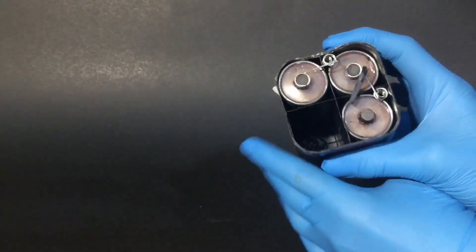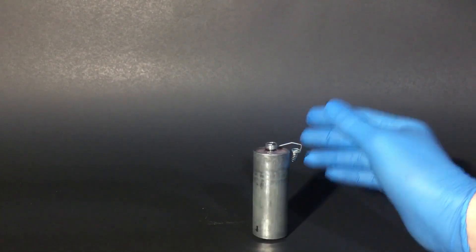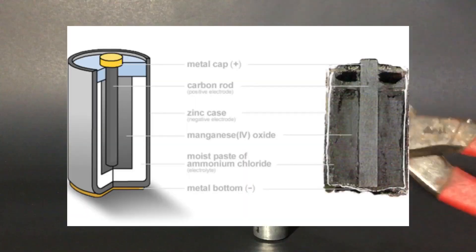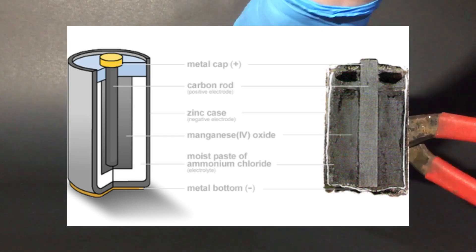The first step to getting this is taking apart a battery. I'm using a 6-volt battery because they have four dry cells which are pretty big. The battery is made of a zinc shell filled with manganese dioxide and a rod of graphite in the center.